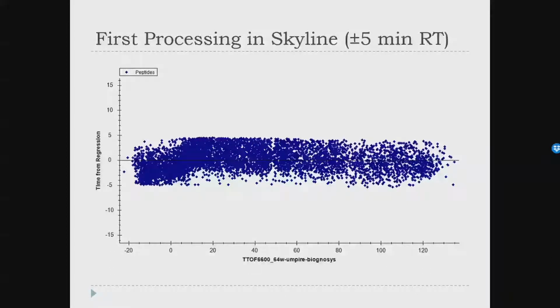Okay, one of the things we're going to be looking at today when we look at our spectral quality, the data quality of the runs that we're using for the spectral library that you just built, is how good the IRTs are. So did we get enough of a basic understanding of IRT yesterday when you created your query parameters?